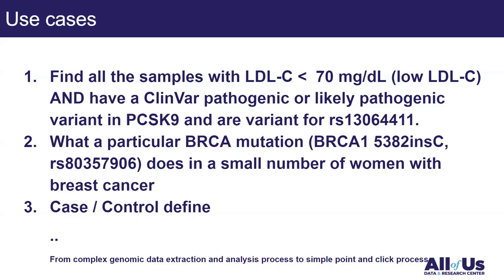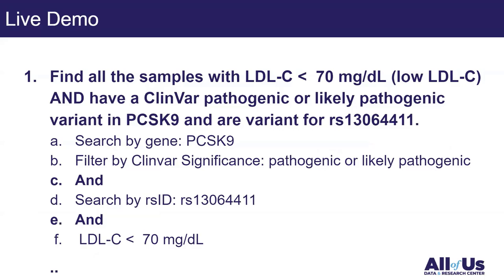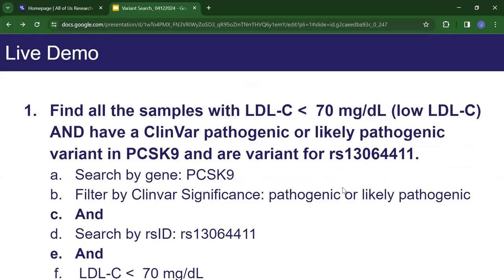These use cases give you a sense of how the new feature will work for your research. I'll use the first case as a live demo: finding all participants with low LDL cholesterol who have a ClinVar pathogenic or likely pathogenic variant in PCSK9 and a variant for a specific RSID SNP. The steps are: search by gene, filter by clinical significance, search by RSID, and filter by LDL cholesterol level.